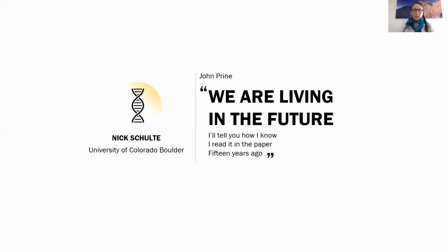Regarding extraction of DNA, are some diatoms more resistant than others to cell lysis? I don't think that has been looked at specifically, but there is an expectation that highly silicified diatoms might be more difficult to break apart.